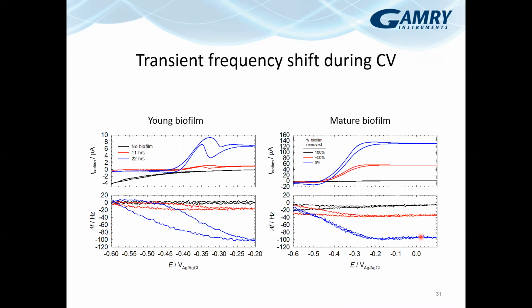We've had several questions now asking if you can couple EQCM to other techniques. One of them could be SECM, or perhaps if you could couple it with a fluorescence technique. Do you know of any examples? I don't know. Actually, yes.